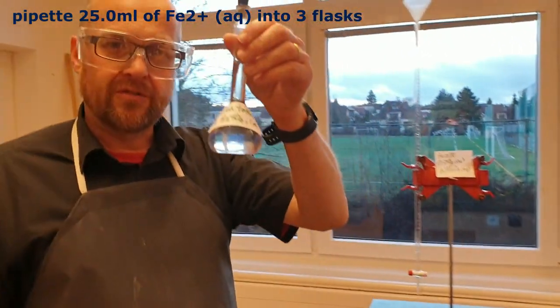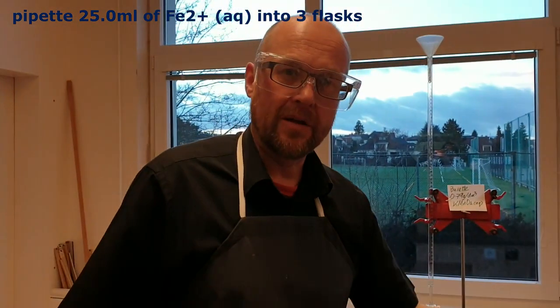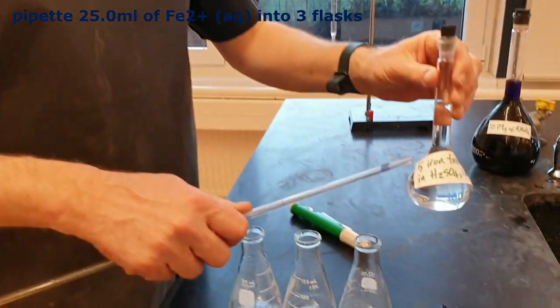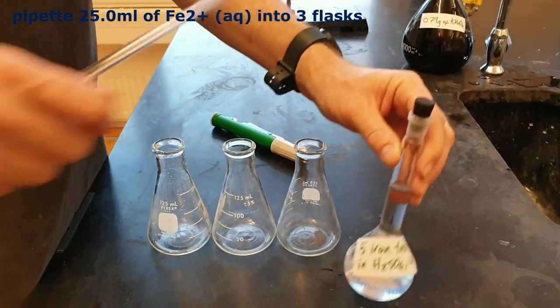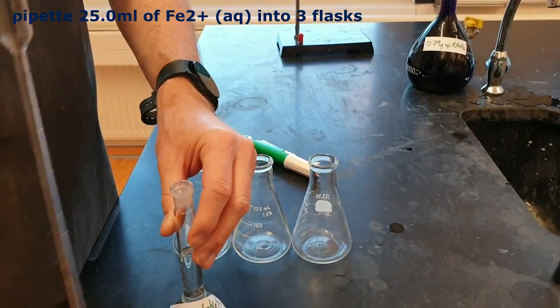We've got five iron tablets dissolved in 100 millilitres of one mole per decimetres cubed sulfuric acid. Now I'm going to pipette 25 mils into each of these three Erlenmeyer flasks. What's the plural of flasks? Flasky? I don't know. Okay, here we go.